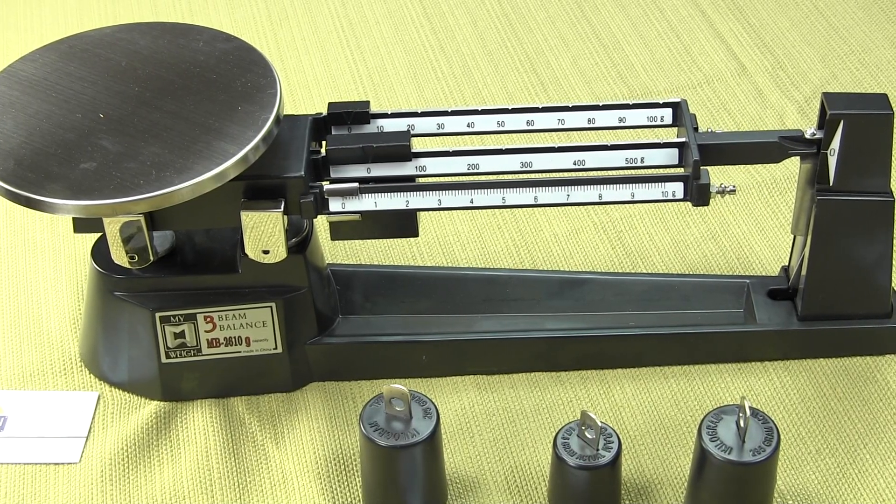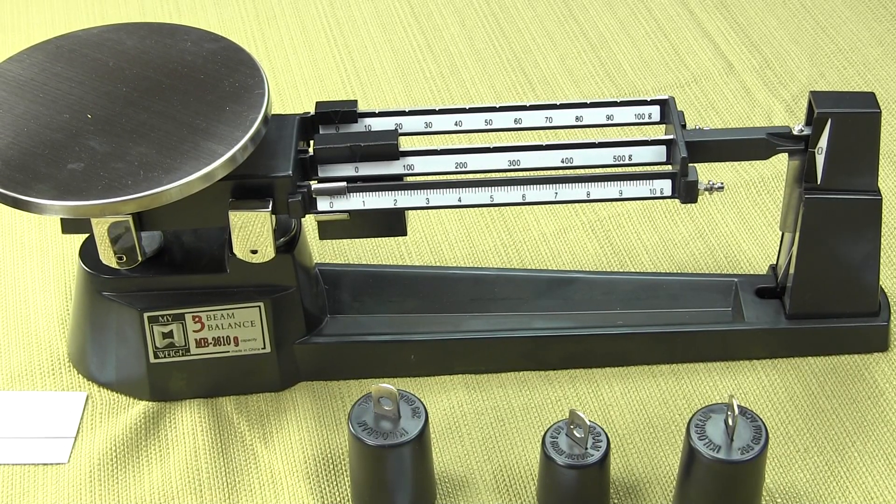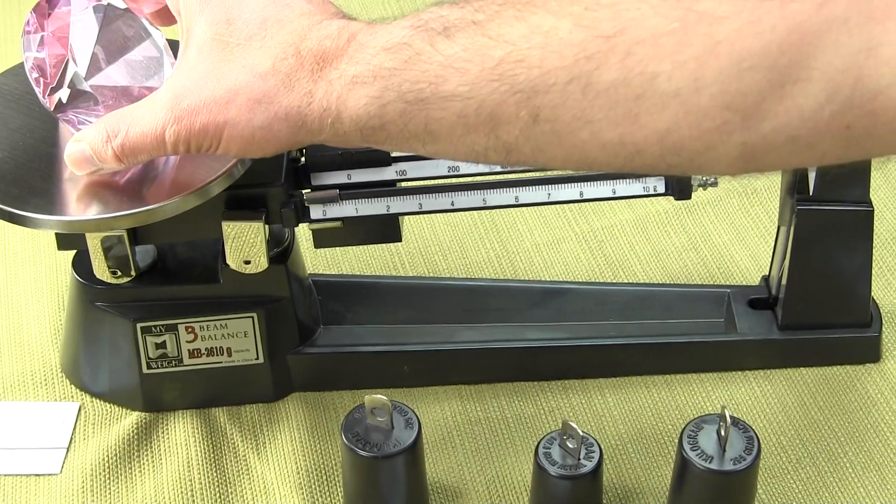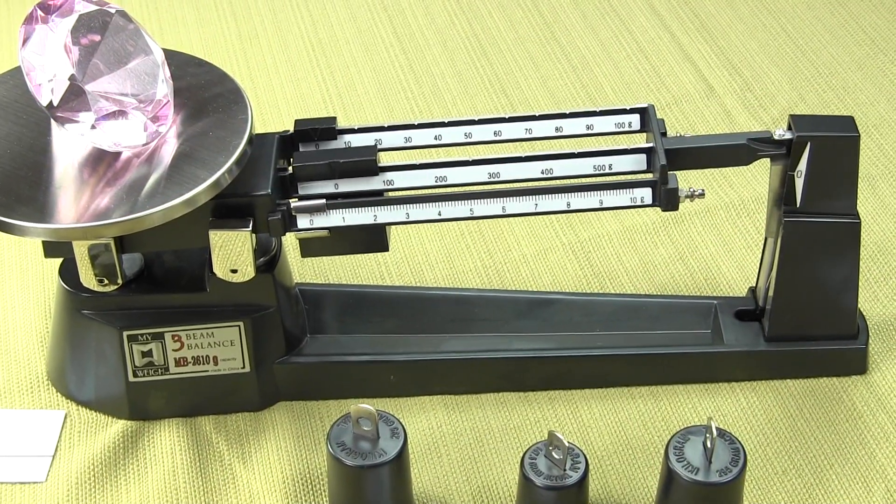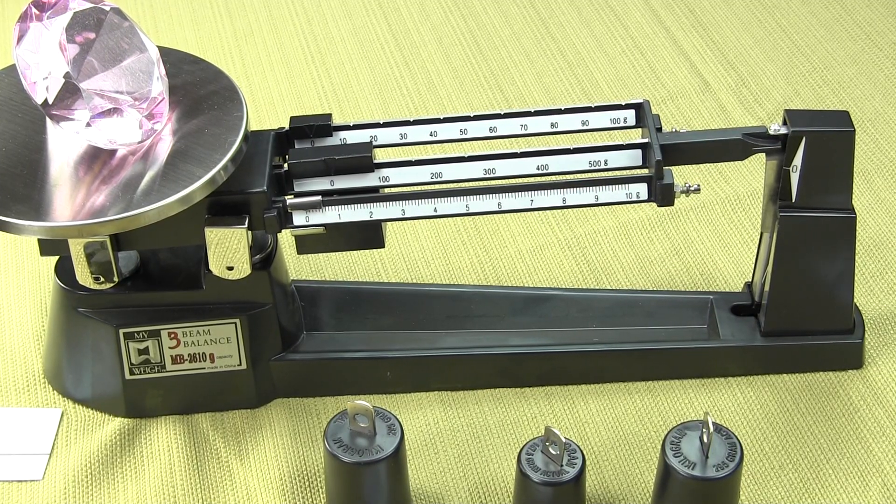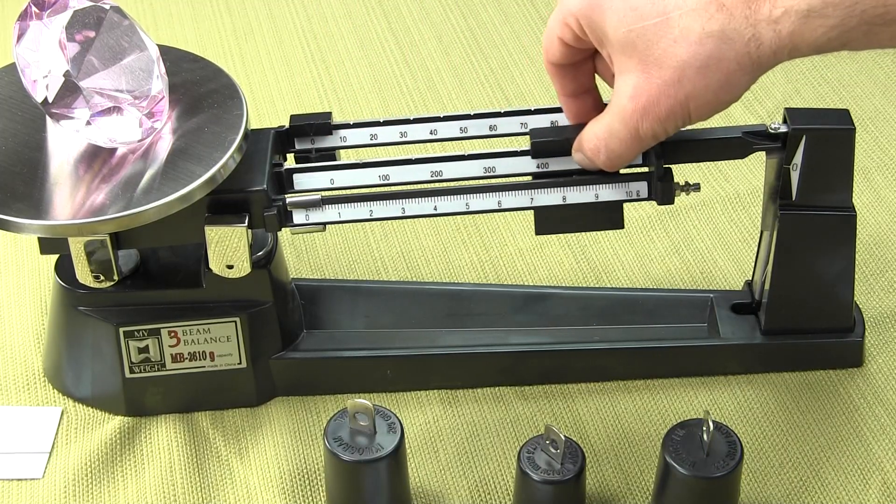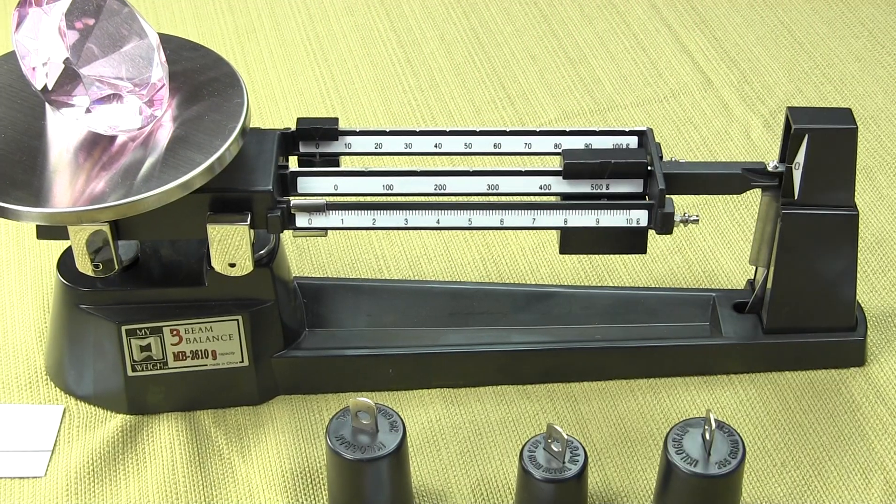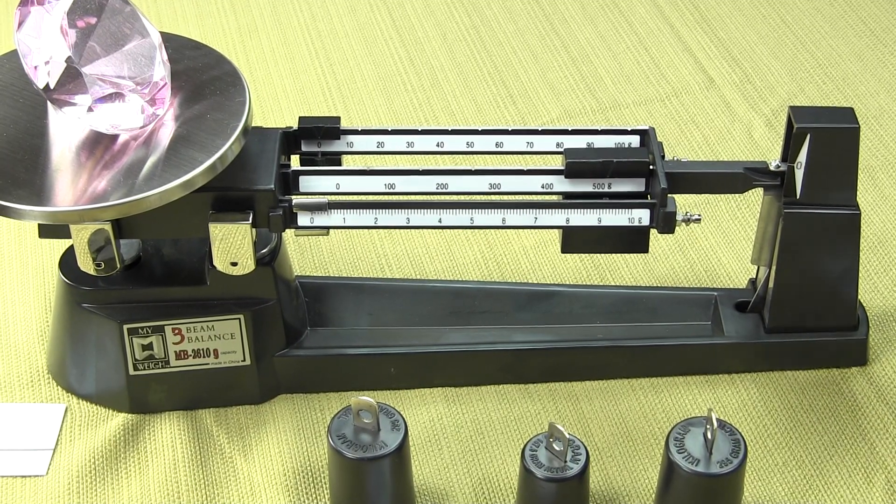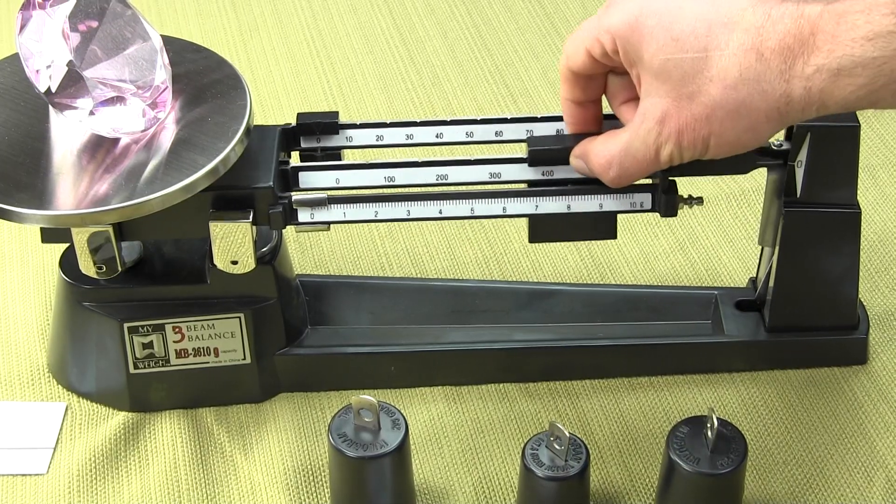Now let's give some examples on how to actually weigh with the three beam. I have here a large diamond. If we put this right onto the weighing platform, the proper way of using the three beam balance is to slide the largest poise all the way across until the beam goes down. When the beam goes down, we know that this diamond is less than 500 grams.